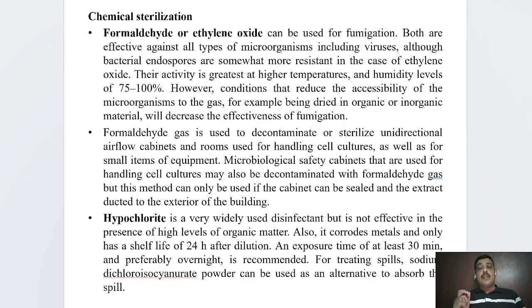Apart from that, it may also tend to corrode the surface, even if it is made of stainless steel. But apart from this disadvantage, it works efficiently against most of the microorganisms, which can be killed.